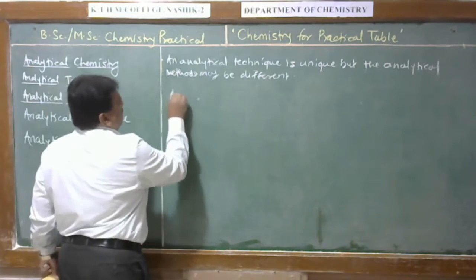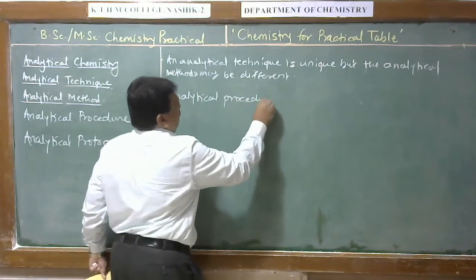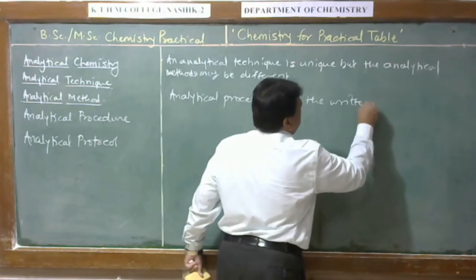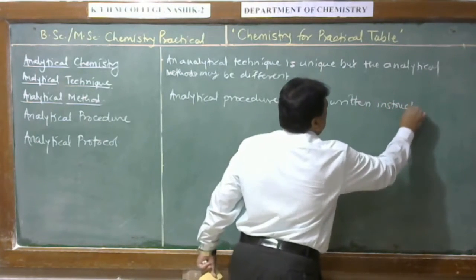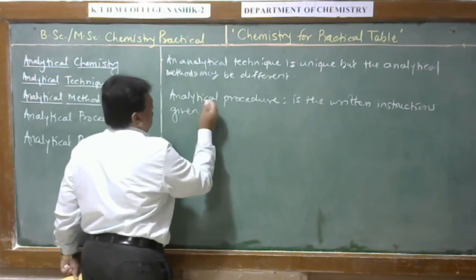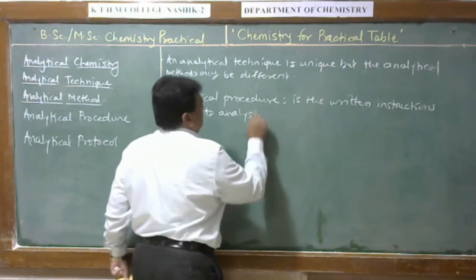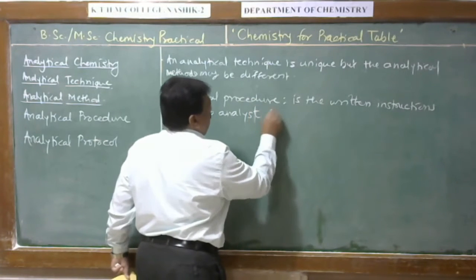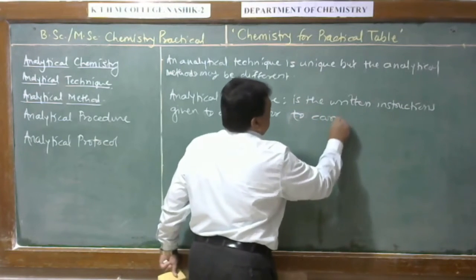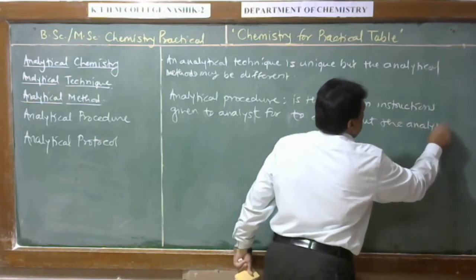An analytical procedure is the written instructions given to analyst to carry out the analytical method.